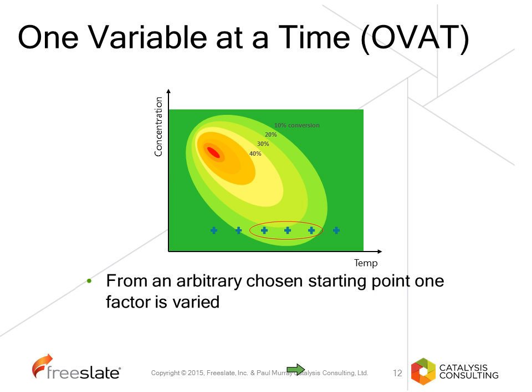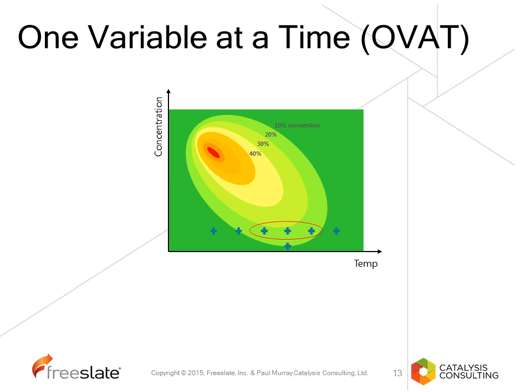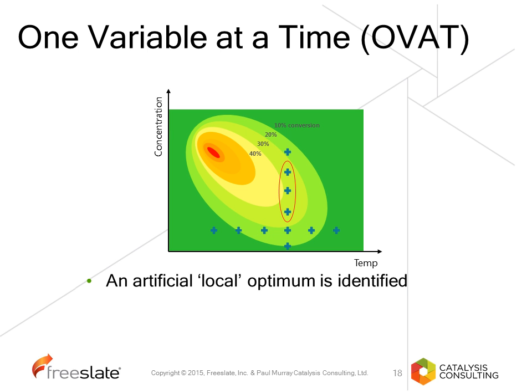So when we start changing concentration, we start to find that the reaction yield, our conversion, is going up, we're getting more product. But we hit a maximum of somewhere in the high 30%. So this is looking like the maximum for our reaction. So what do we do now? We have a reaction which is not good enough, and we don't know how to move forward.